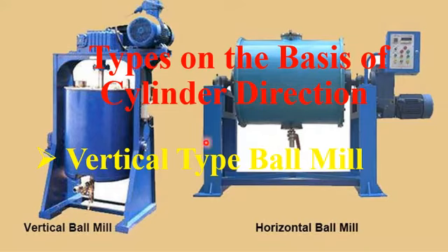So in simple words, students, horizontal type ball mill operators have a horizontal shape like this, and it is usually operated under closed conditions, so the environment outside is not interacting with the inside setup of the ball mill, and in this way the crushed material is very fine and very pure.